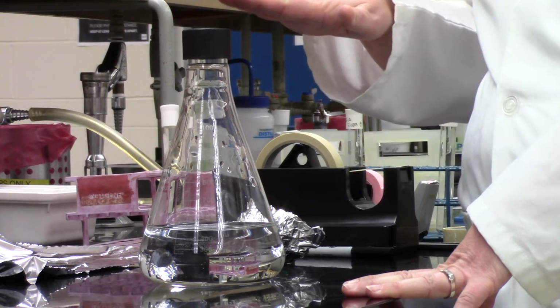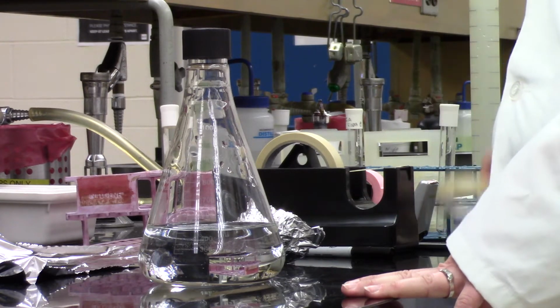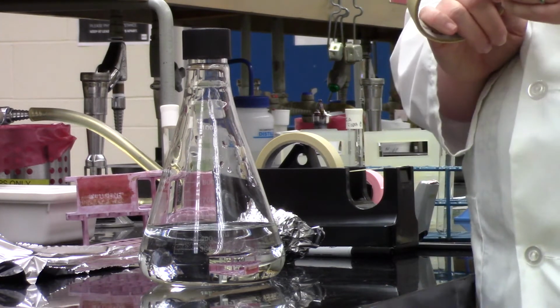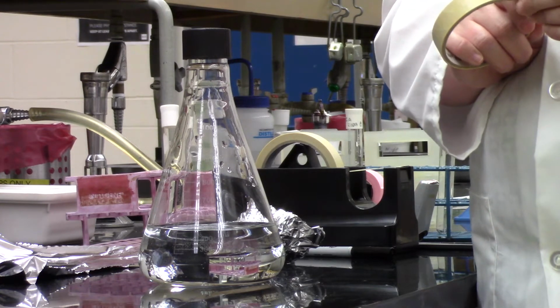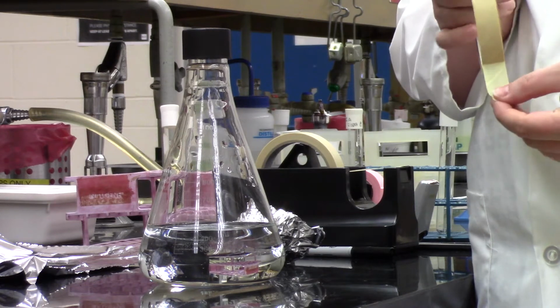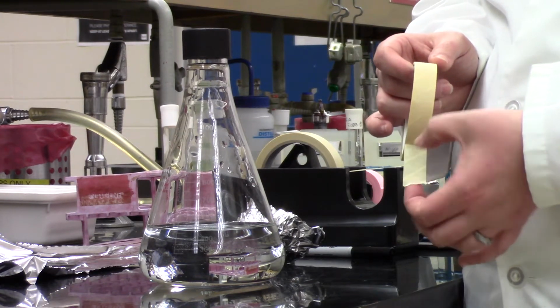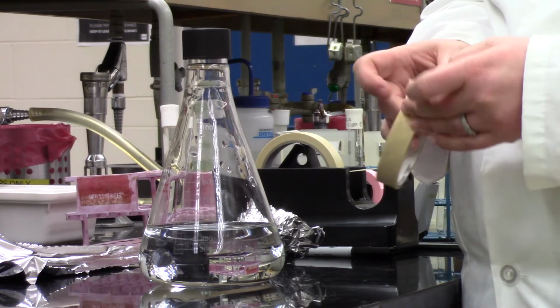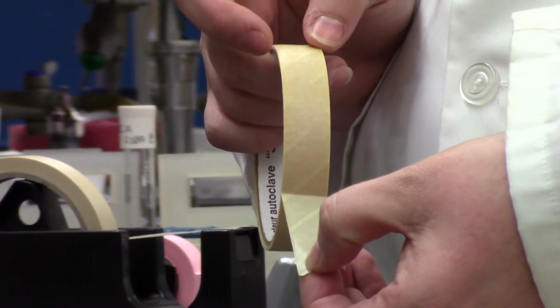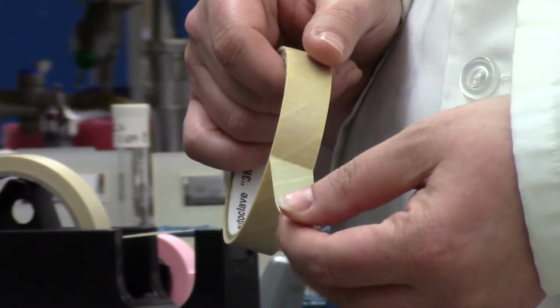Once you've got your container covered up, there are 2 more steps before it's ready to go in the autoclave. The first is to put some indicator on it. So this is indicator tape or autoclave tape. You might be able to see that there's a very subtle stripe going across it. Once that tape goes through the autoclave, that very light colored stripe is actually going to turn black as long as it reaches the correct temperature.